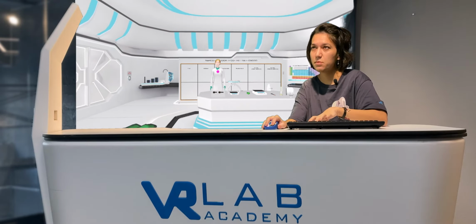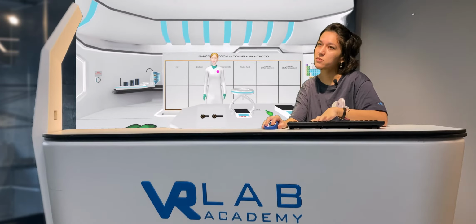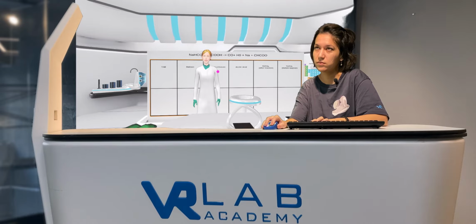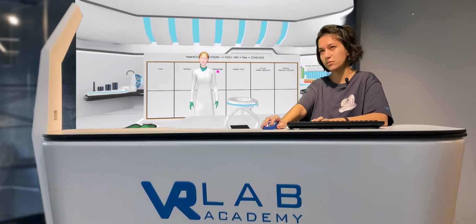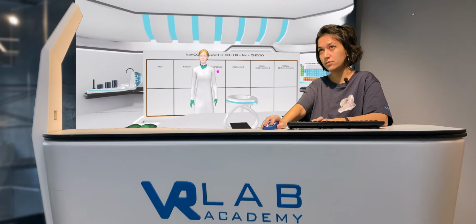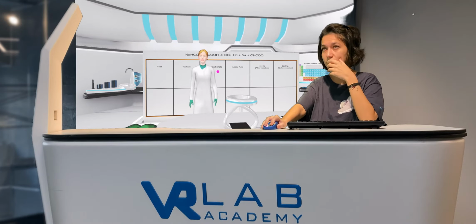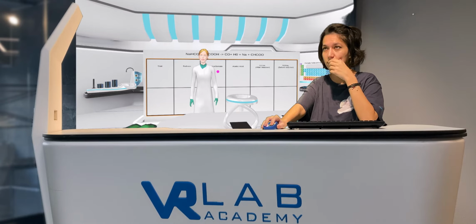Here we meet Amy, and she gives us information about the experiment. "Hello there, I see a science enthusiast. Welcome to VRLab Academy. I'm Amy, your lab assistant. In this experiment, we will learn the law of conservation of mass, one of the basic laws of chemistry, and the concept of the mole. The law of conservation of mass tells us that the total mass of the reacting substances is equal to the total mass of the products. Let's learn this law by experiment."